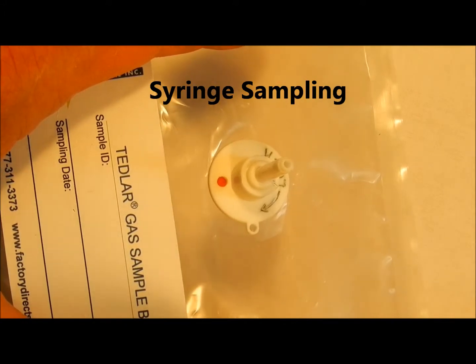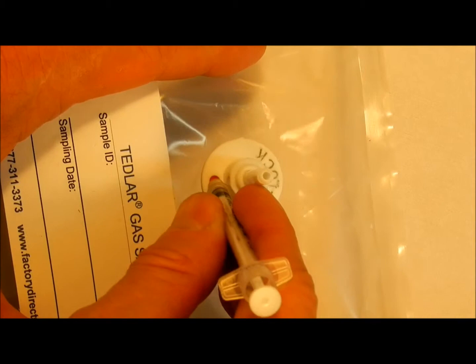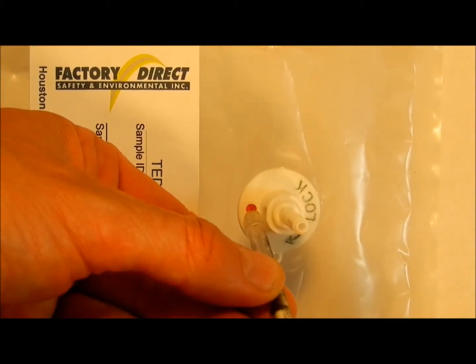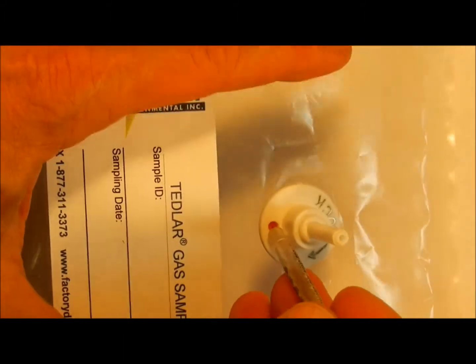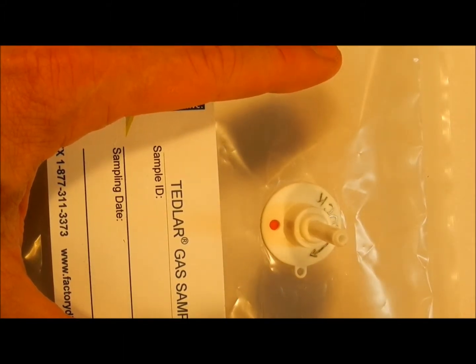To sample a filled bag with a syringe, simply insert the needle through the septum port. Remove the sample and remove the syringe. The septum forms a tight seal even when the syringe is removed.